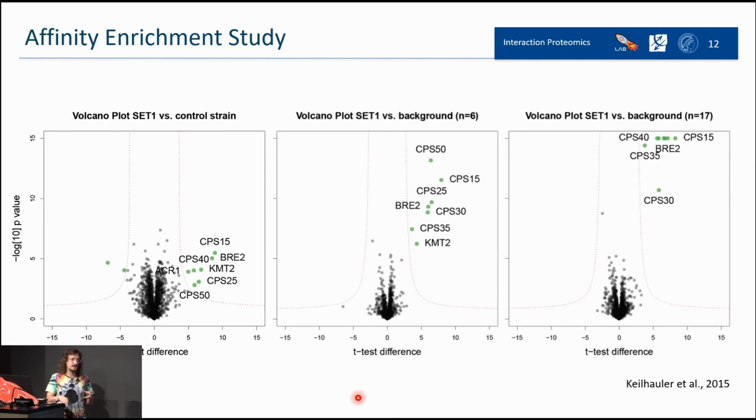Because you expect unspecific binders to be similar in all your experimental conditions, because they are things that just attach there, and so they should be present in all the experiments. So what you can do is plot your log fold change of the specific binders against this whole background noise. And it's called the complement.